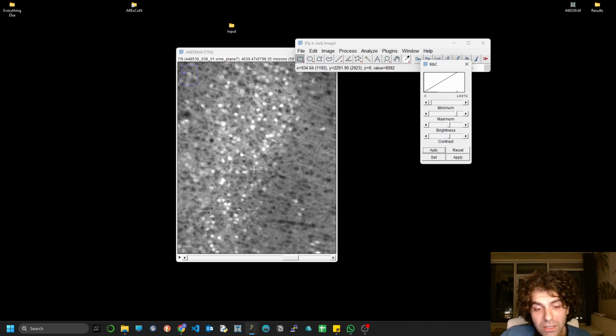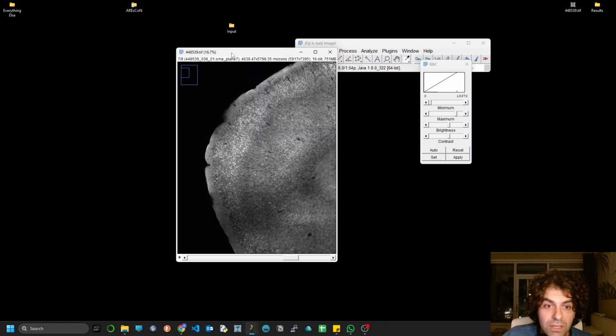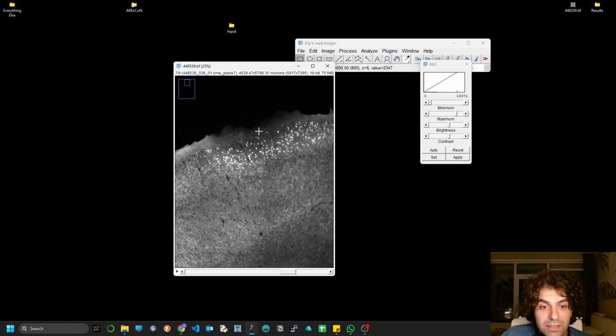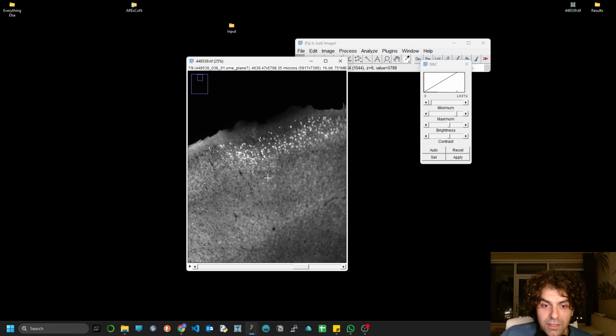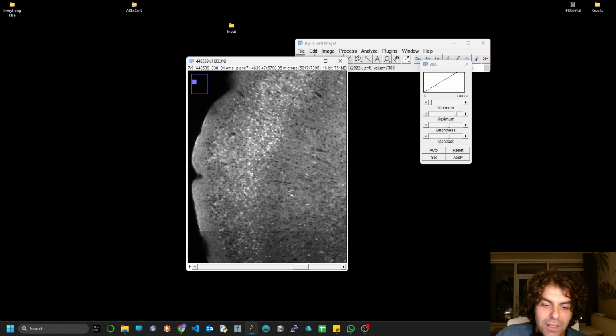With the AI sample finder that I'm using, for 3 channels and for a single hemisphere like this, with 16-bit images and 20x magnification, I think it takes something between 20 and 30 minutes. That's a lot of time, and you need to consider if that's something you want or not, in case you want to fully capitalize on the capabilities of AResCoN.